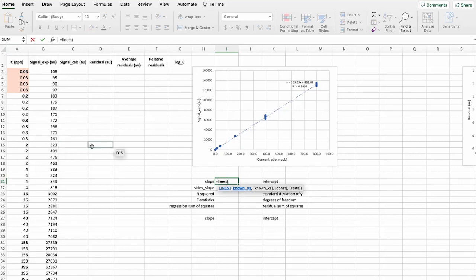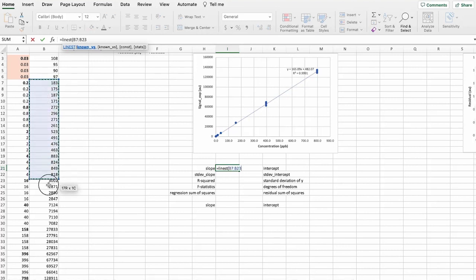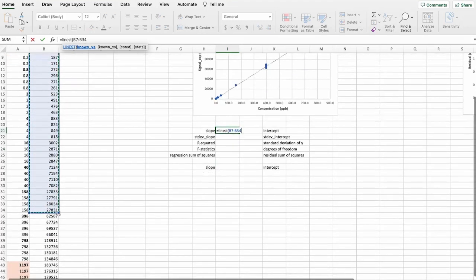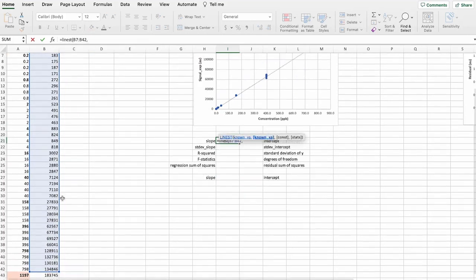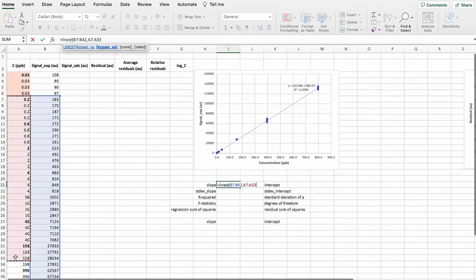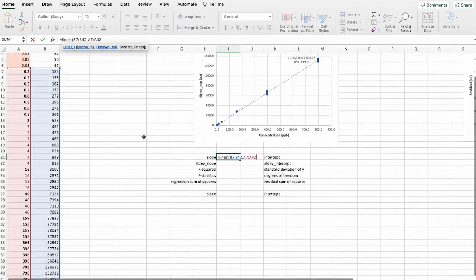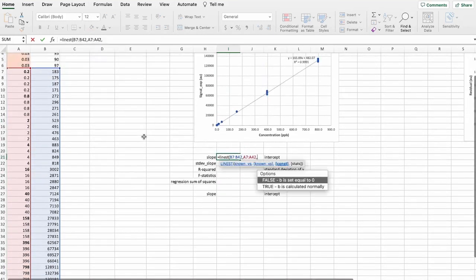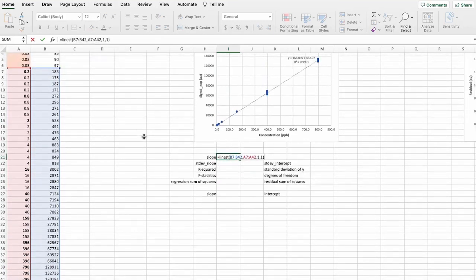And let's use a LINEST function for that. So we will need the areas, the signals, the peak areas that we had, and the concentrations.